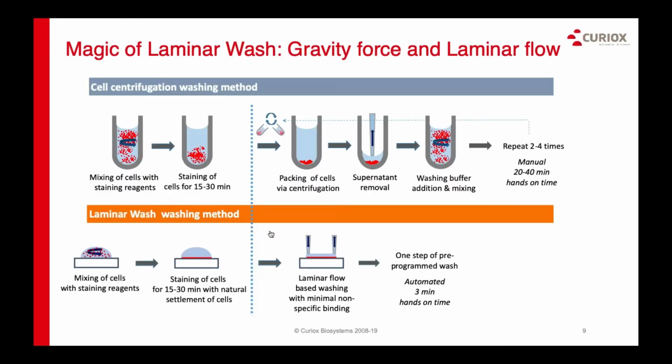So the retention of beads and cells on the plate is based on well-characterized forces of gravity and fluidics, in this case, a laminar flow. And these are very well-known forces in nature. The secret is that the use of each force is on an almost flat, wall-less plate, so we can control the forces. At the bottom of the slide, you can see the working mechanism of cell processing by a laminar wash. The cells are mixed and settled on a plate by gravity, and the settling takes 20 minutes or so, usually during standard incubation periods during a staining protocol.